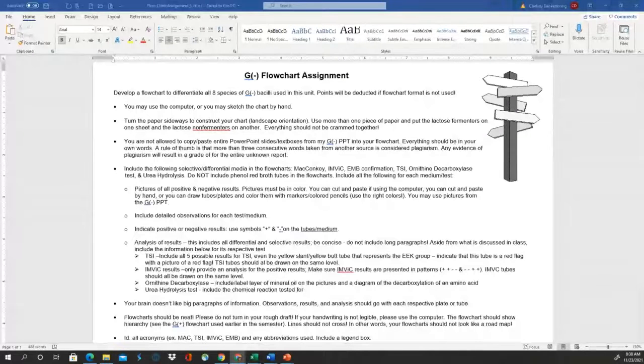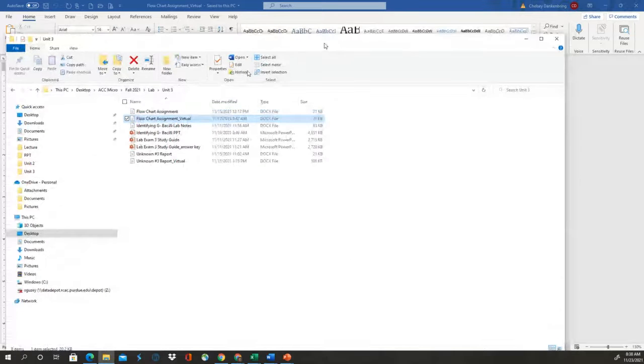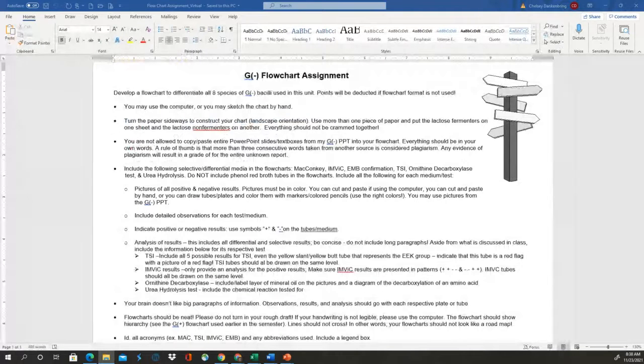Hi everyone, this video is going to be a brief walkthrough of the unknown number 3 report, which is really just you creating a flowchart. So what I want to point out is that for this assignment, you're essentially creating your own version of the unknown chart that was provided to you for Unit 2.